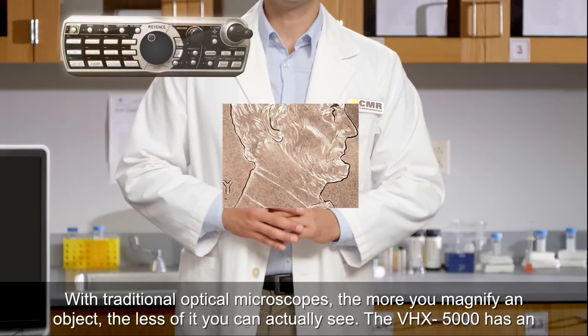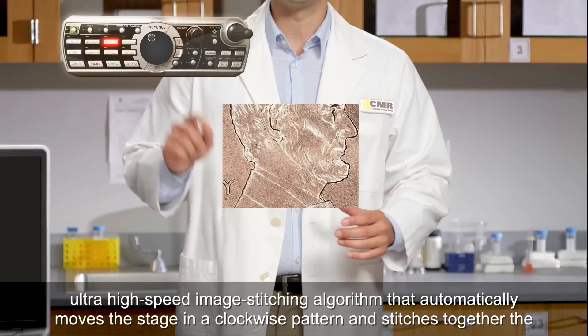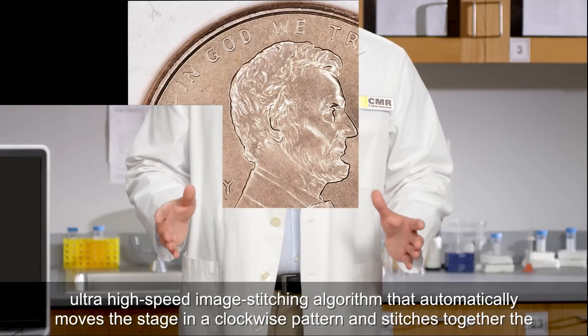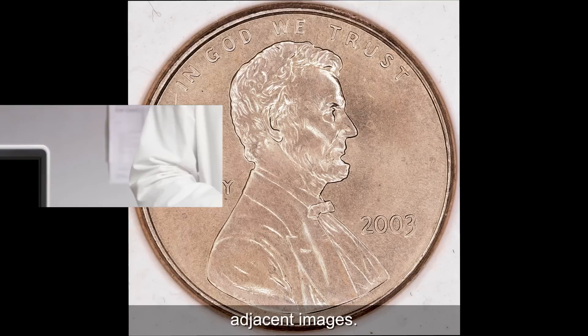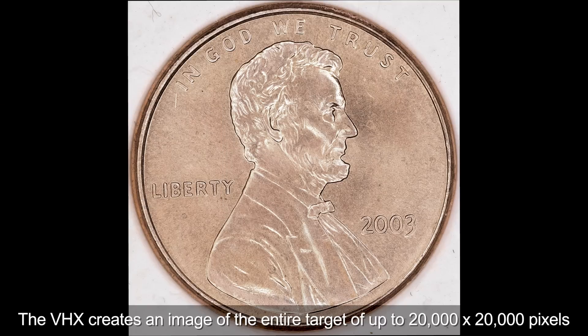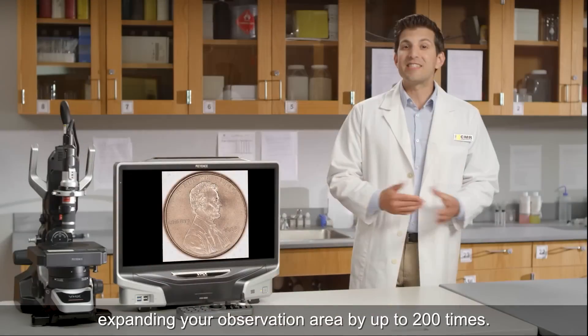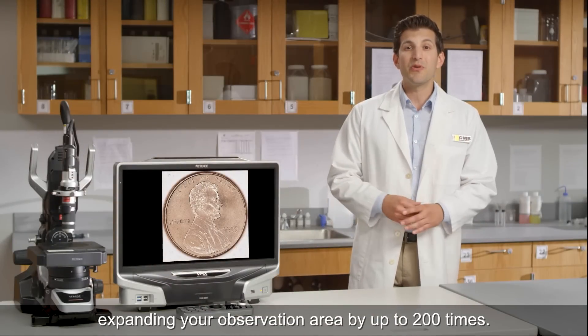The VHX5000 has an ultra-high-speed image stitching algorithm that automatically moves the stage in a clockwise pattern and stitches together the adjacent images. The VHX creates an image of the entire target of up to 20,000 by 20,000 pixels, expanding your observation area by up to 200 times.